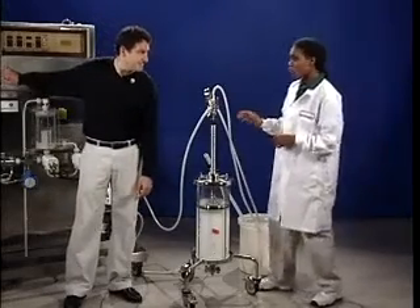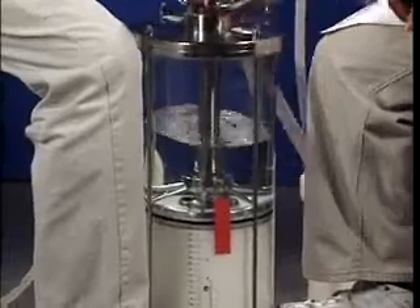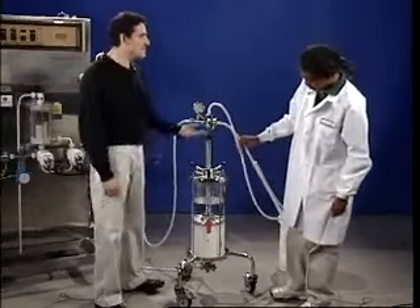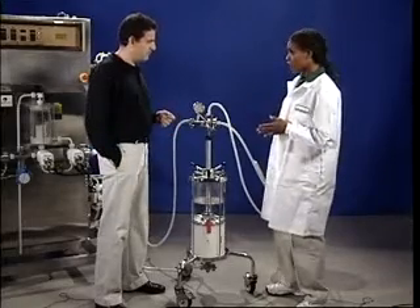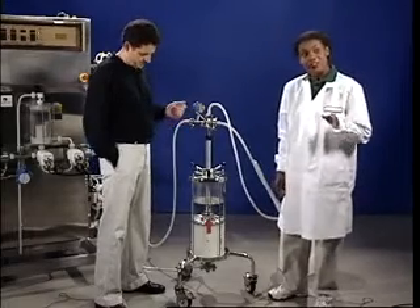3, 2, 1, go. That was fast — and right at 20 centimeters. The bed is compressed like a spring. When the flow stops, there's no force to keep the bed compressed, so it begins to expand. If the adapter isn't put in place quickly, too much expansion will occur and we won't achieve acceptable compression. That's why speed is so important.